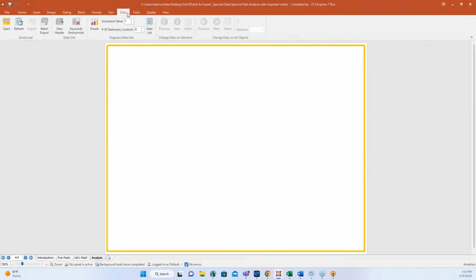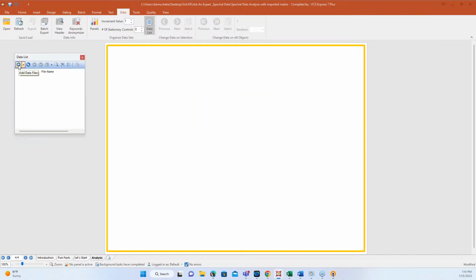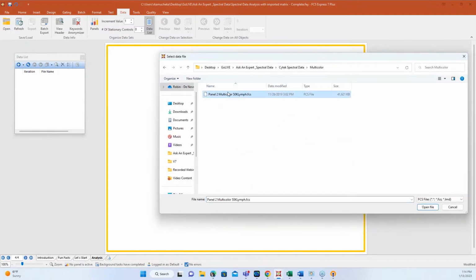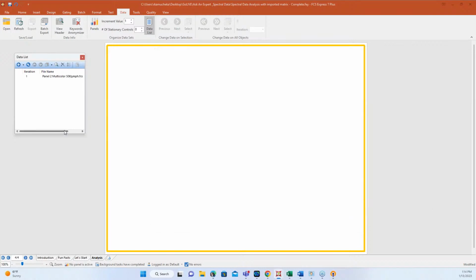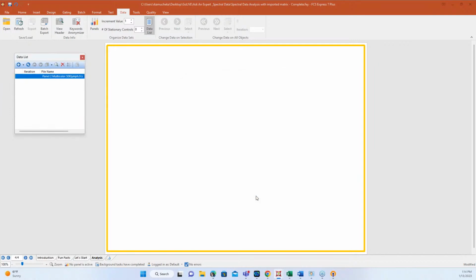When we move to analysis, it gets pretty simple. It's just like working with just about any other data file. You can drag and drop a data file in here. You can insert a plot and select a data file. You can use the blue plus icon. I'm kind of old school, so that's my way to go. I grab my data file here and insert it. Now it's in my data list, and I like to drag and drop it in. Again, you'll have all the similar choices that you would working with any other data file.